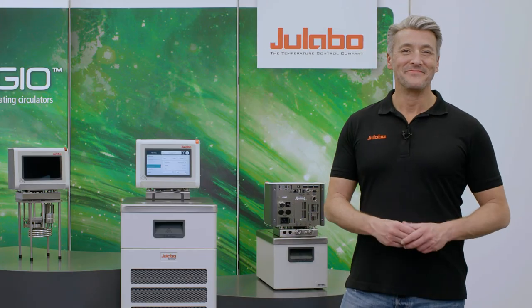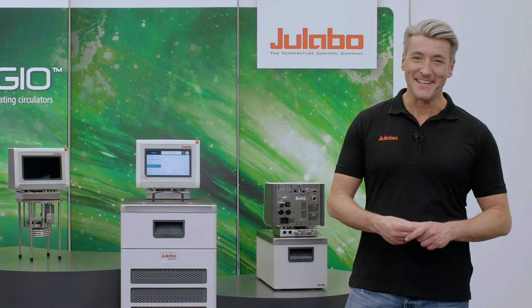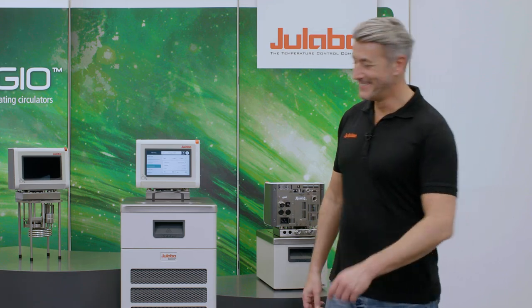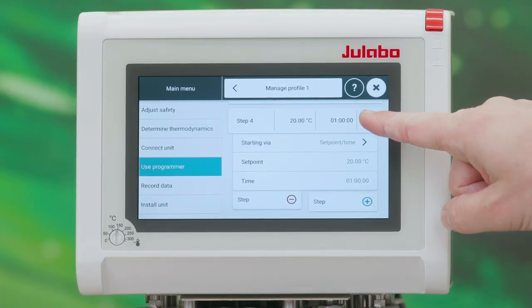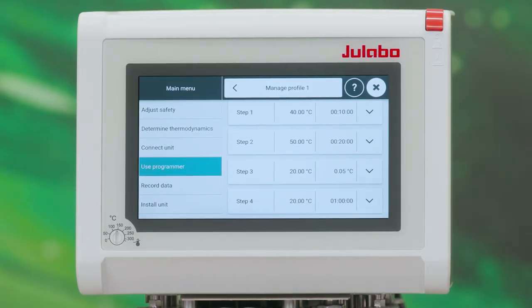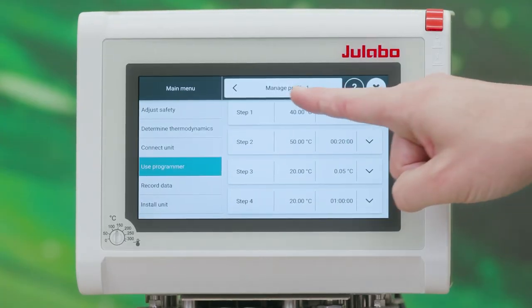That's it! The profile is now ready for use. In the submenu you can review all steps in the desired order.